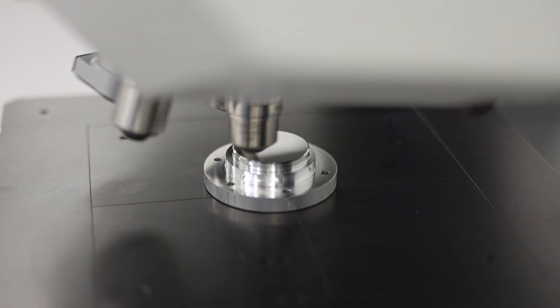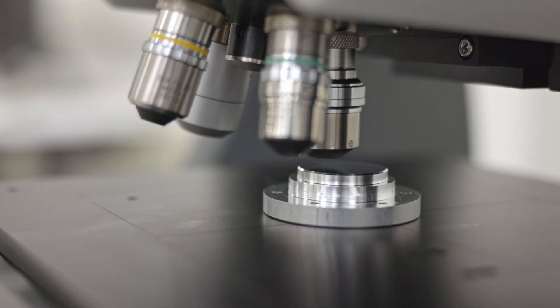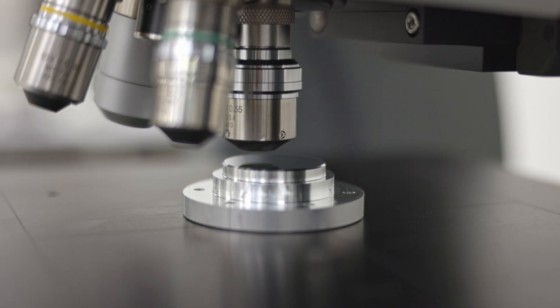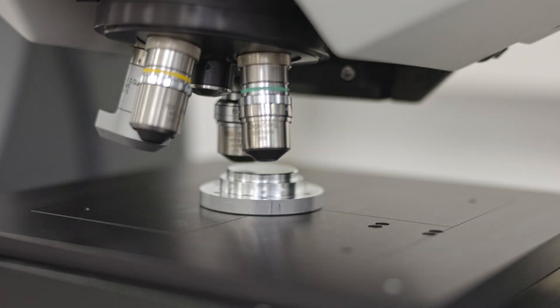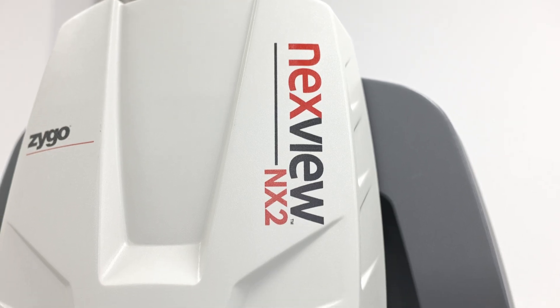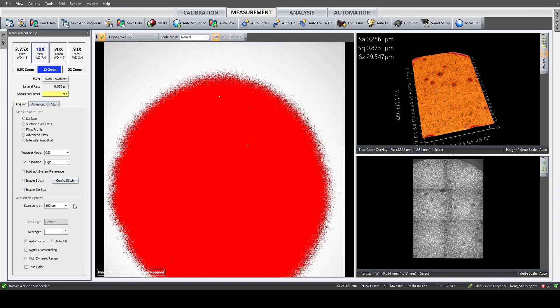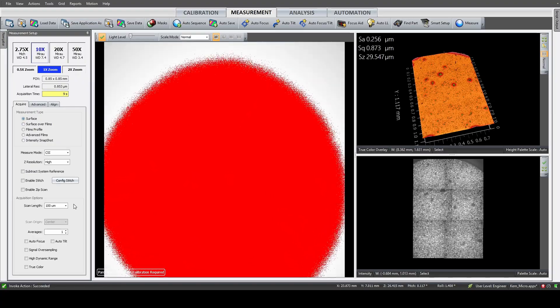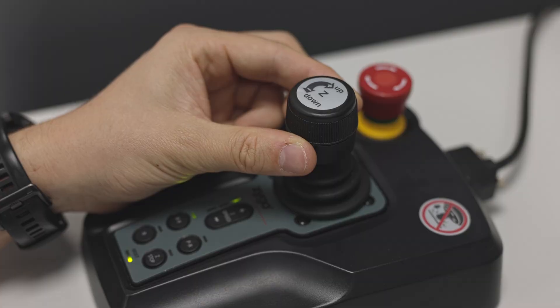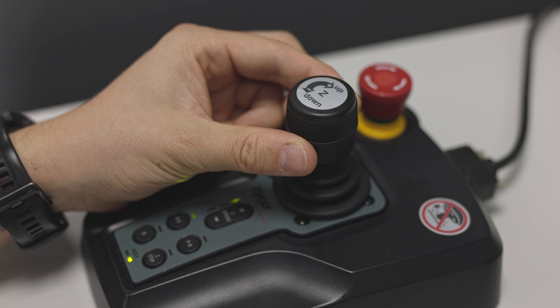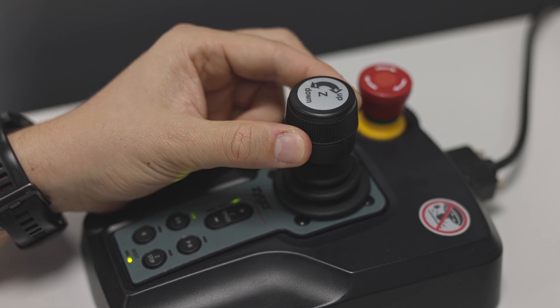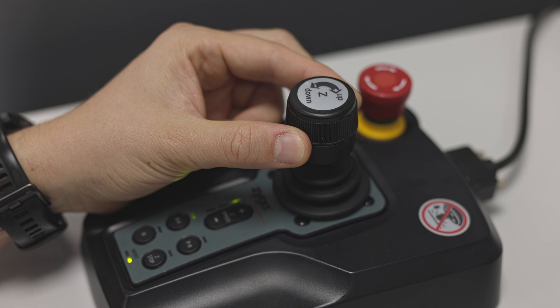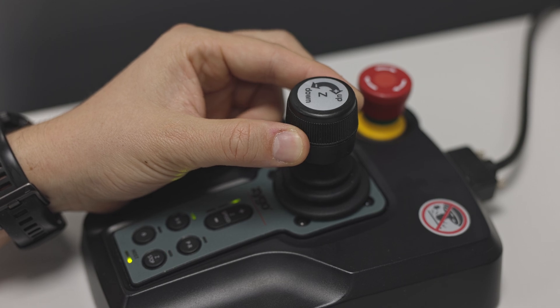Find the surface, tilt the part so it's parallel to your image plane, adjust focus and light. I'm also switching to a higher-resolution objective lens, a 50x magnification NA 0.551. To rough focus the part, I'm using the joystick to jog down until the part is roughly there. This is always a little bit of a tricky situation because you don't want to run into the part.